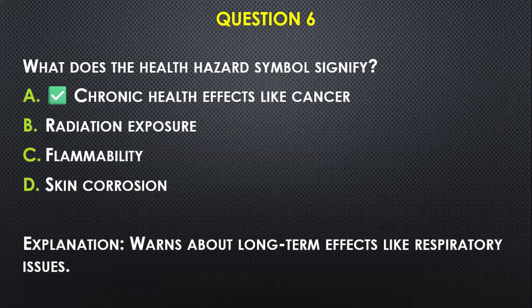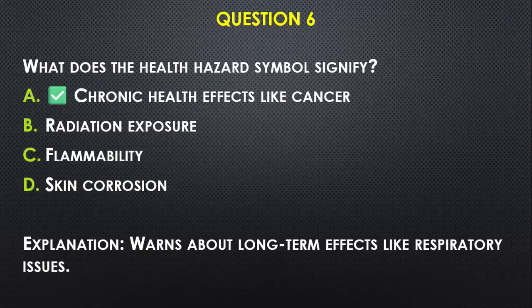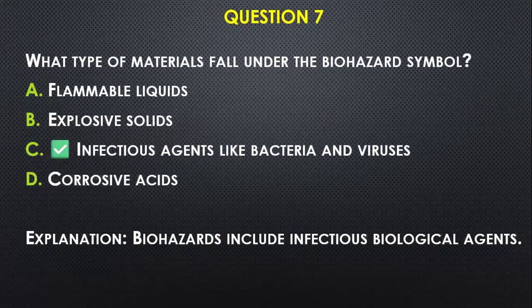Question number six: What does the health hazard symbol signify? A) chronic health effects like cancer, B) radiation exposure, C) flammability, D) skin corrosion. We go with A — chronic health effects. Chronic means long-term; not only cancer, but also respiratory issues, fertility and reproductive issues are also associated with those agents.